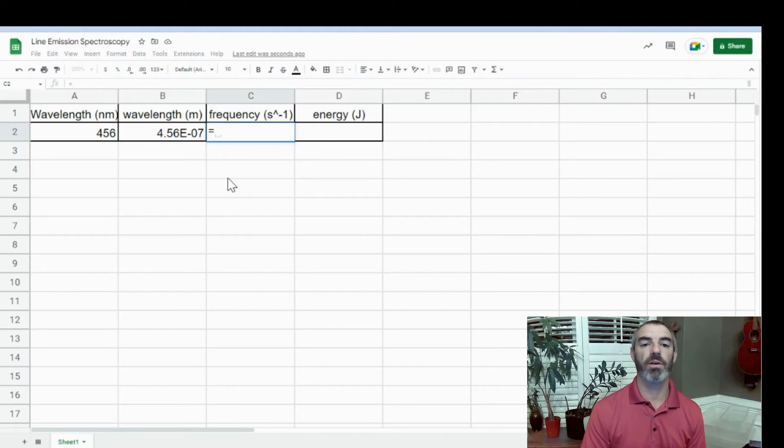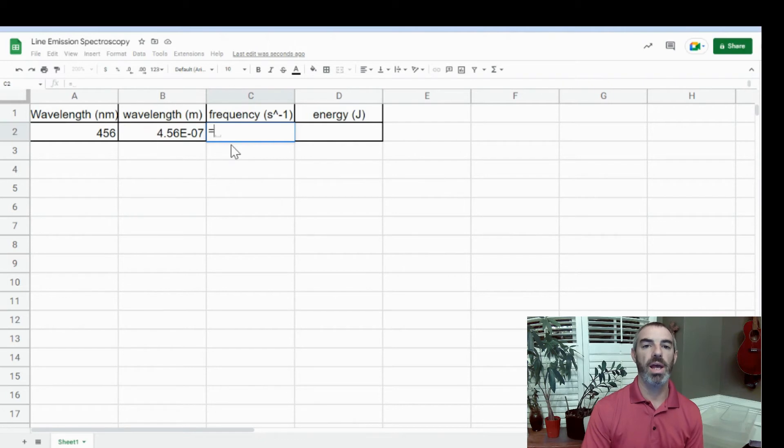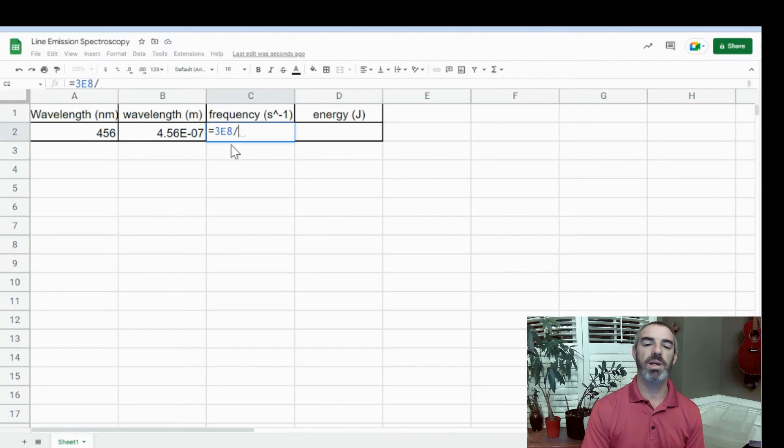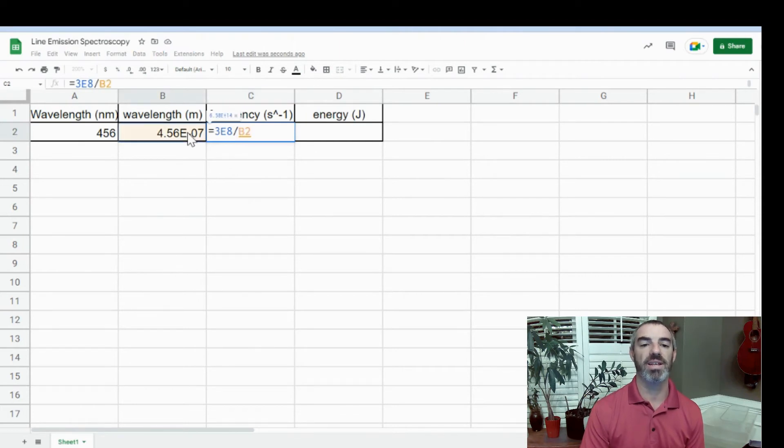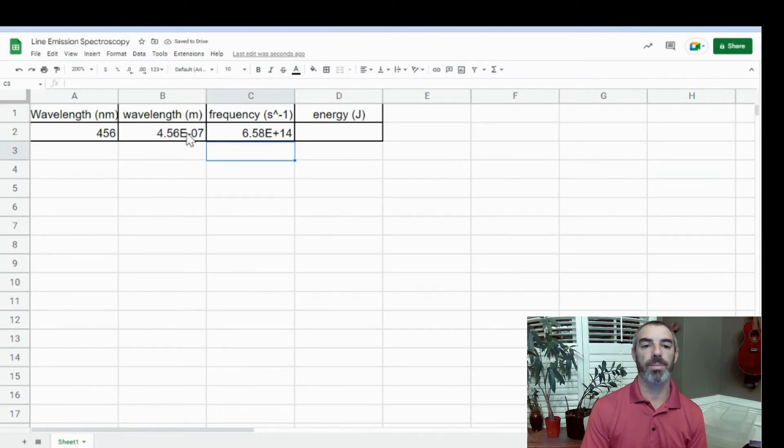Now let's convert frequency in inverse seconds. Again, you're going to type an equal sign. We know that frequency is equal to speed divided by wavelength. The speed is the speed of light, which is 3 times 10 to the 8th. We're going to divide that by B2, and that gives us our frequency.